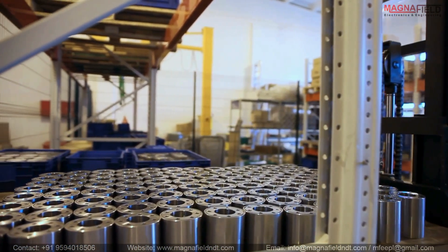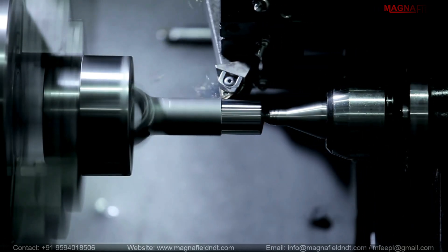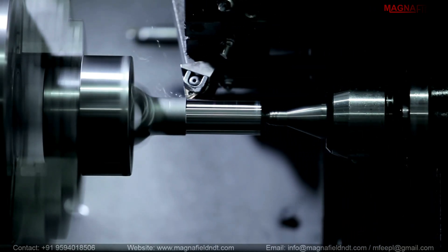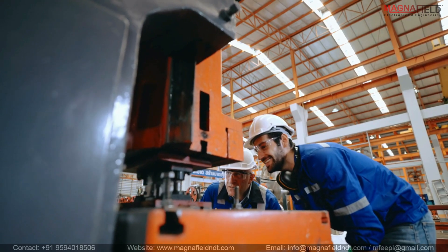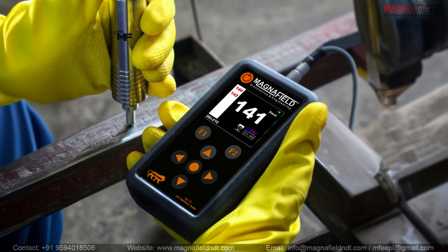Imagine a world where materials endure extreme conditions, heavy loads, and constant wear. How do you guarantee their resilience? In the world of manufacturing, precision is paramount. Ensuring the durability of your materials is crucial — and that's where hardness testing comes into play.